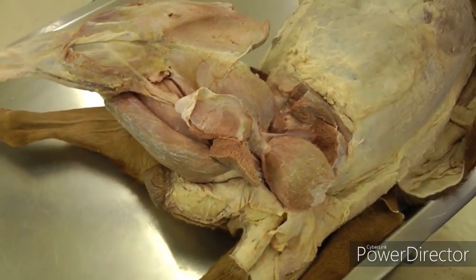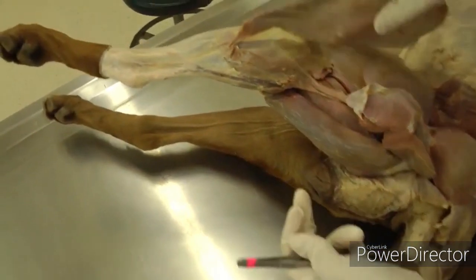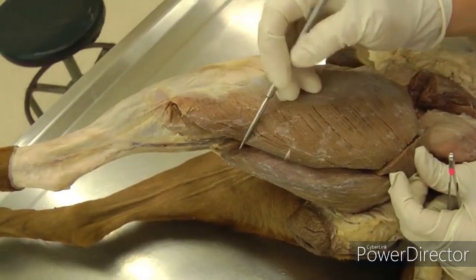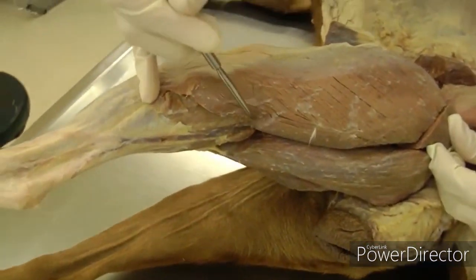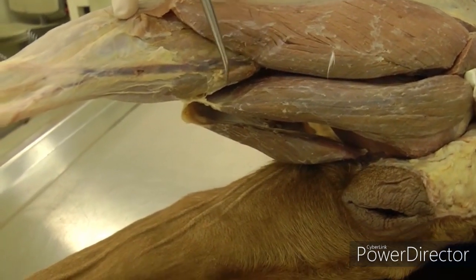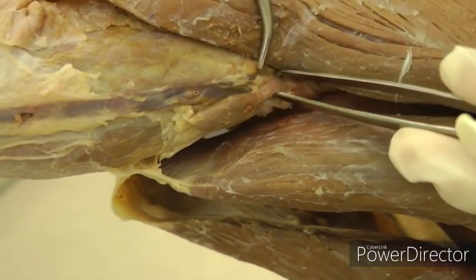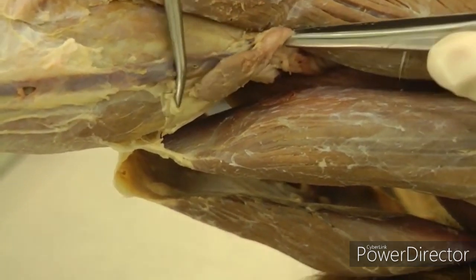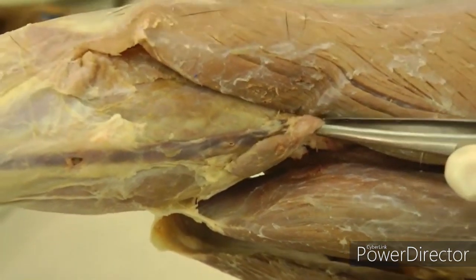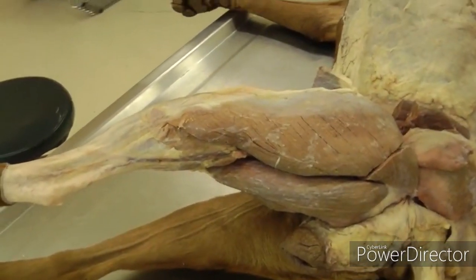One thing to go back to is the popliteal lymph node. As you're working on the biceps femoris on the caudal edge, there's a bunch of fat and fascia right there — you'll find the popliteal lymph node between the biceps femoris and semitendinosus. There may be one or two; sometimes there's a couple. Try to preserve it if you can — it's a bit hidden in the fat. That should be it for lab five.